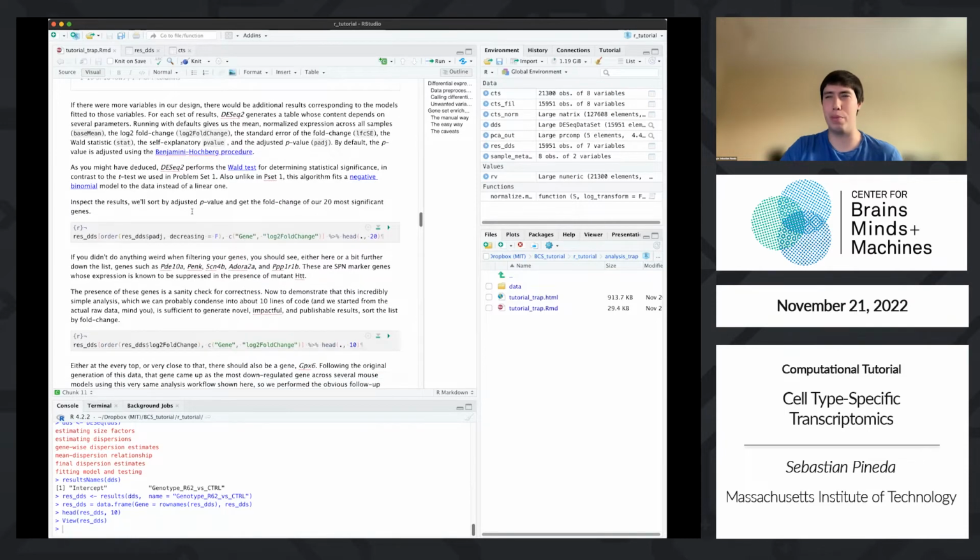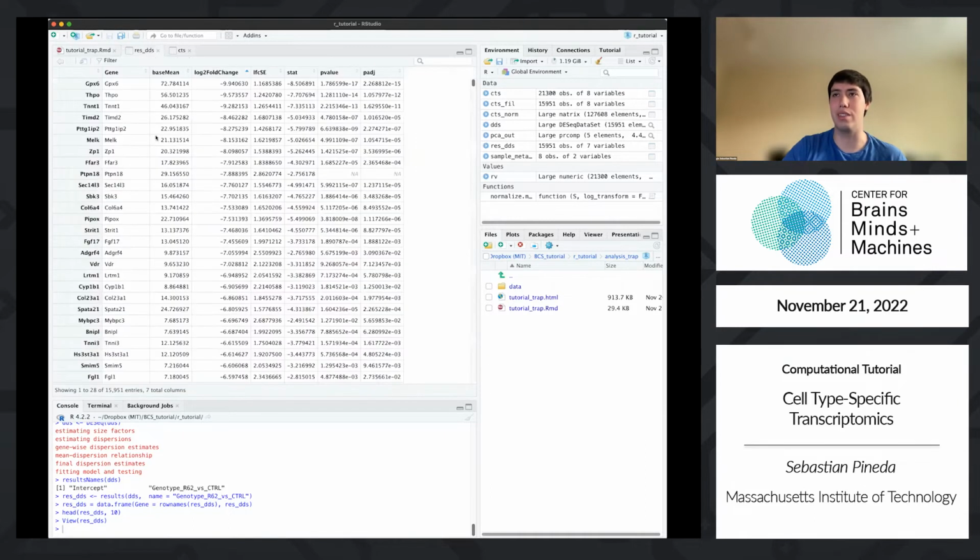We didn't have to do much pre-processing once we got the raw data. The data was already very clean. We could condense all this to maybe 5 to 10 lines of code, and that's our results table. This is what you'd make a nice little bar chart or something. Throw this in an Excel file and supplementary data, it's ready to publish.